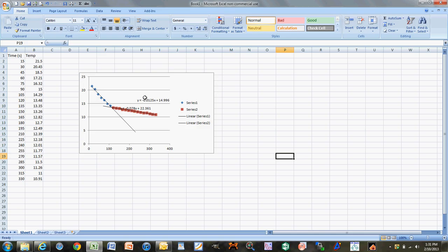As long as you have the two equations, that's really what you need for this lab. Note that this will be true for the rest of the semester: if you switch your two columns and plot temperature versus time instead of time versus temperature, your lines will not give you the same slope. So please be careful throughout the semester about which values are your x and which are your y. If you're not getting a number that seems right, you may have your columns switched.